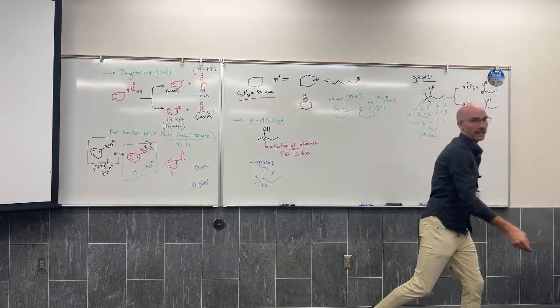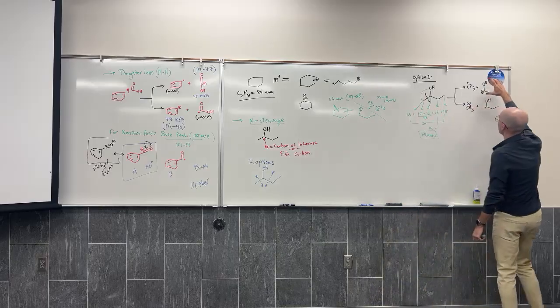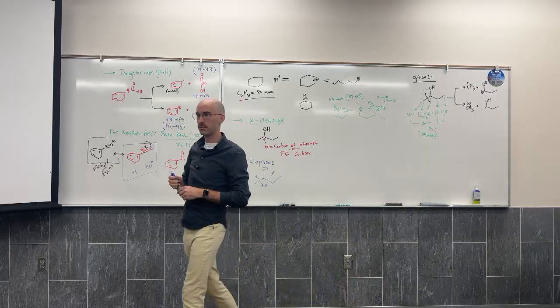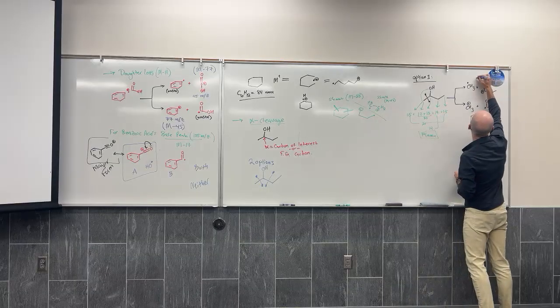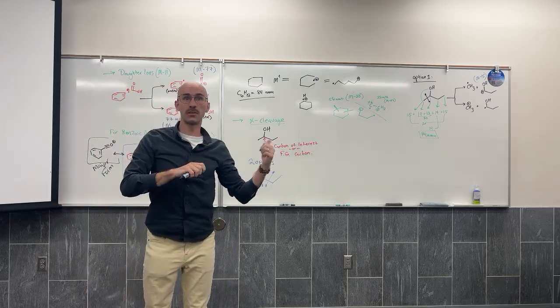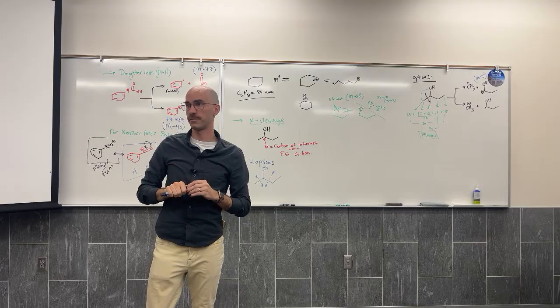Okay, so my molecule weighs 74. This possibility of fragmentation on top will give one reading. What mass will it give? What can I call the signal? I can call it the M-15 signal. Why? I cleaved off a CH3, and that radical gets pulled into the waste. And so the signal will show up at what mass per charge?